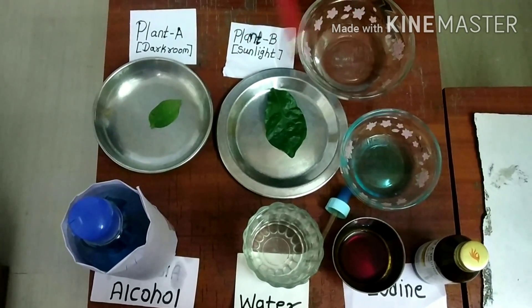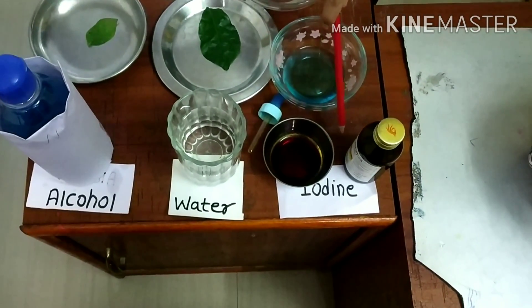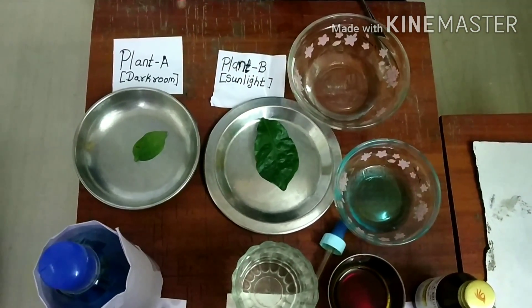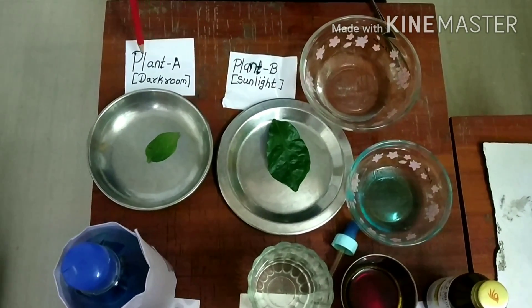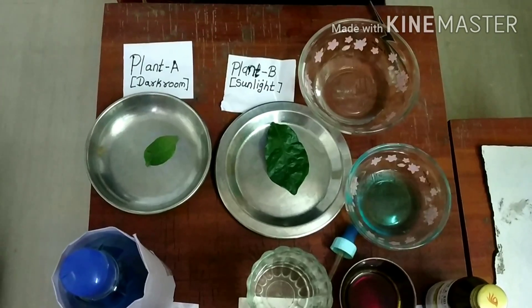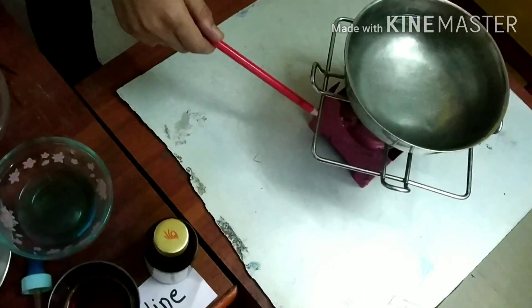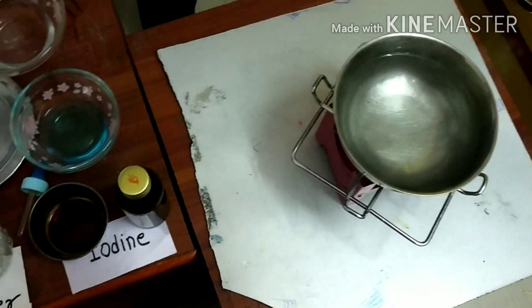Now let us open this dark room and check it out. Here we have water, alcohol, and iodine. This is Plant A which is in the sunlight, and this is Plant B which is in the dark room. These are the evaporating dishes, this is the burner, and this is the stand.